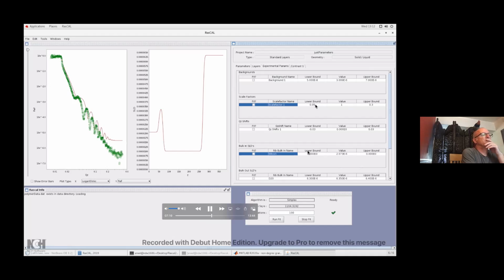And also because normalization is always sometimes a little bit off, let's give this one a range. Let's let this one go. All right, 1.1. And that's it. We have our model set up. Again, background is a bit high here, so we've associated with this background. Actually, let's make sure we fit this.